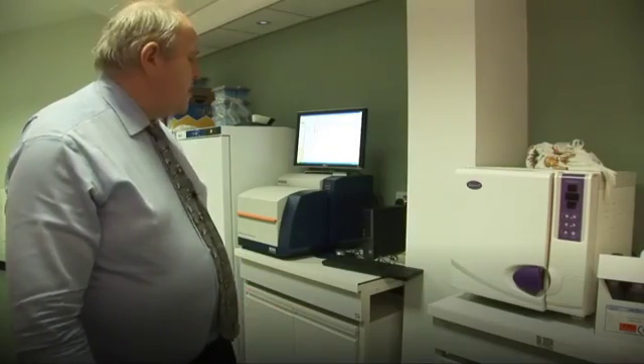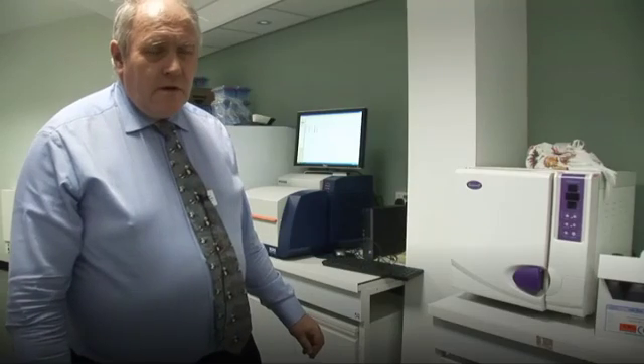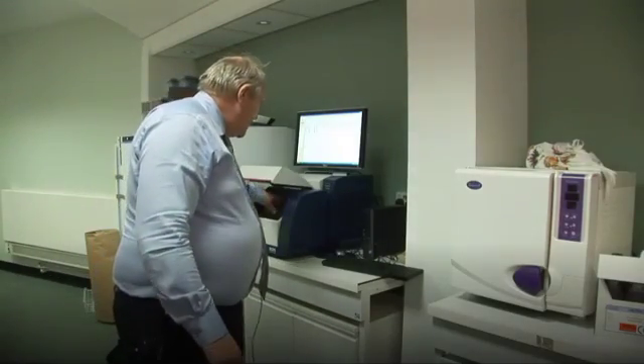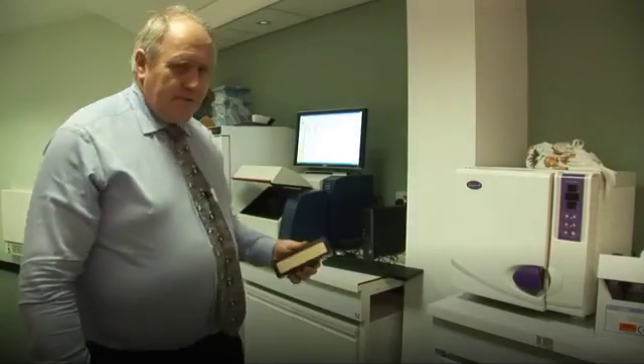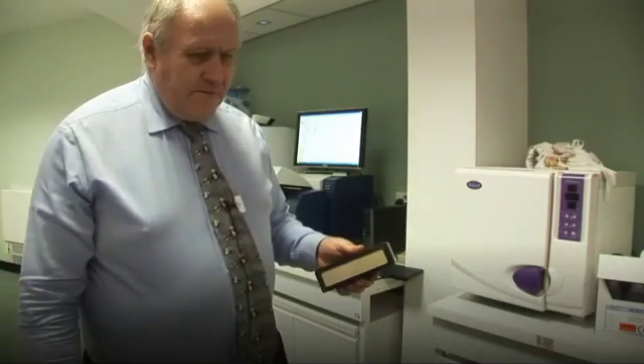We're very pleased to have this facility in the lab here. In fact, we are the only zoo in the United Kingdom, and probably in Europe, to have this technology for our use. We make good use of it not only for ourselves but also provide a service for other zoos, where we can analyse the nutritional value of their forages.